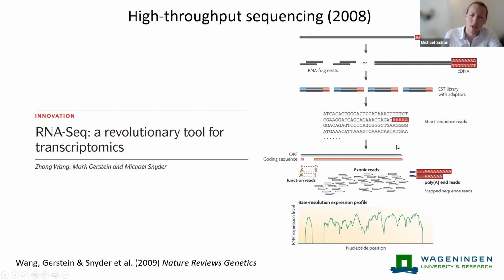We can collect millions of short read fragments and then map them to the genome, and they can either map along the body of a read, or they can map with a gap, and that gap reflects the intron that was spliced out of the mature molecule. So with millions of short reads, of course, that necessitates new algorithms to piece them back together.